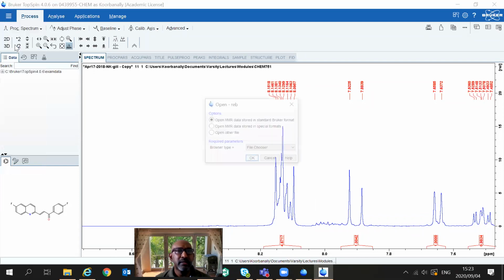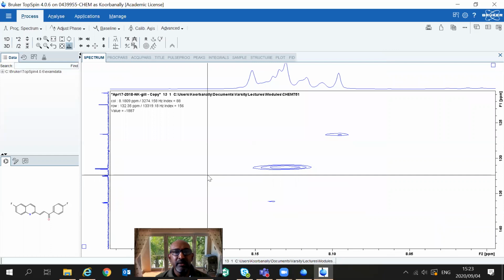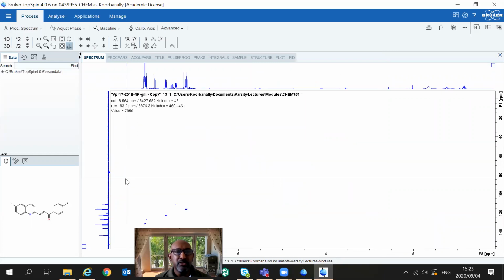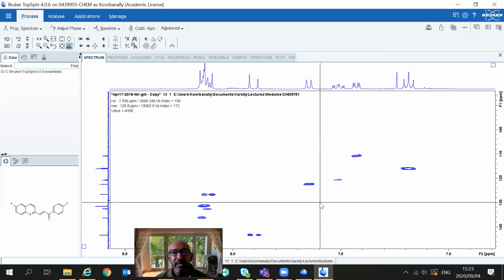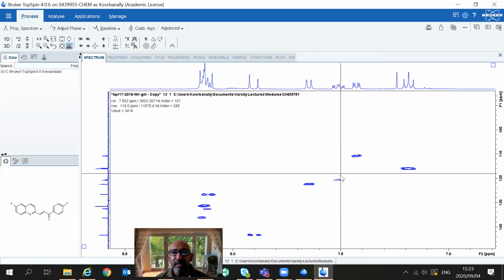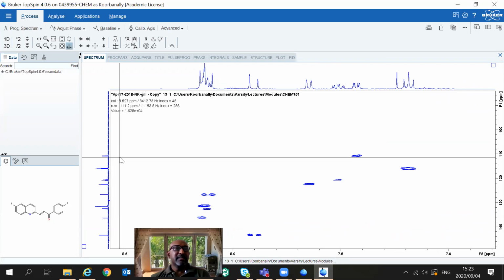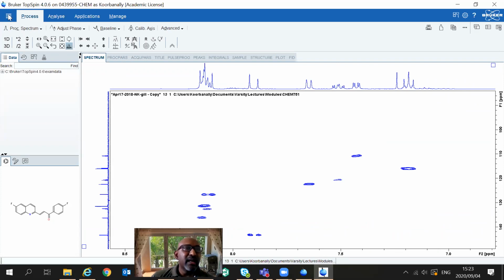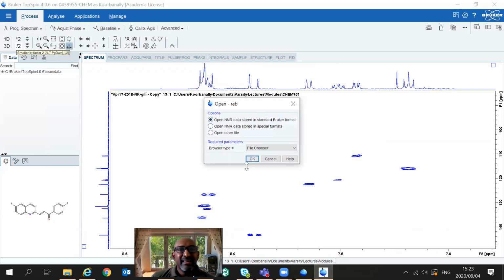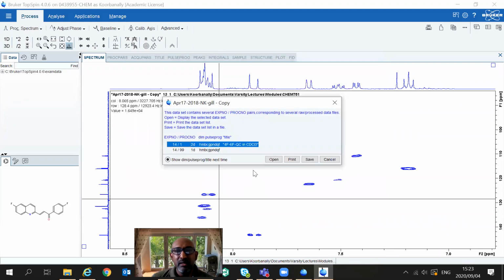So we actually know how to look at an HSQC spectrum. You know how to get the information here. The main thing is that every protonated carbon must be identified, and you can identify all those protonated carbons. All right, now the next thing we're going to look at is the HMBC. This is the last spectrum that we're looking at before we close.